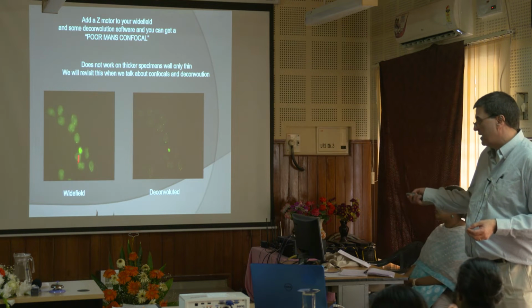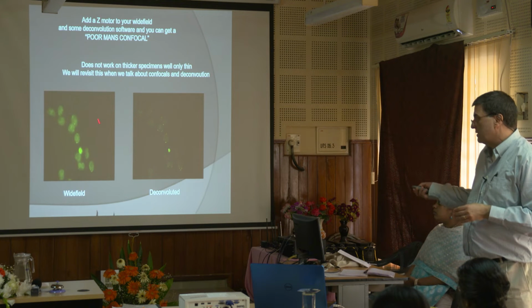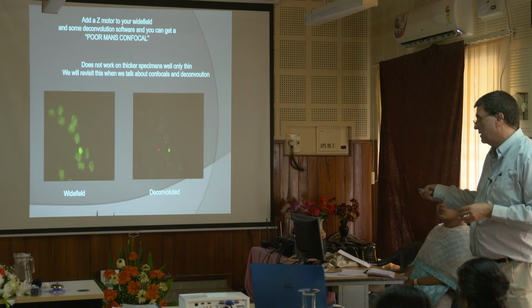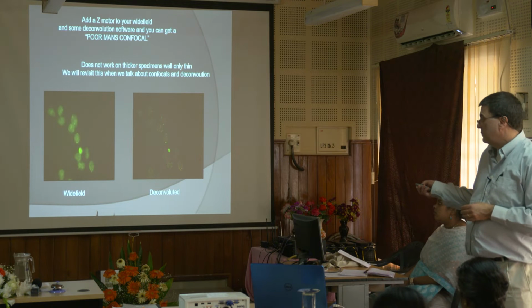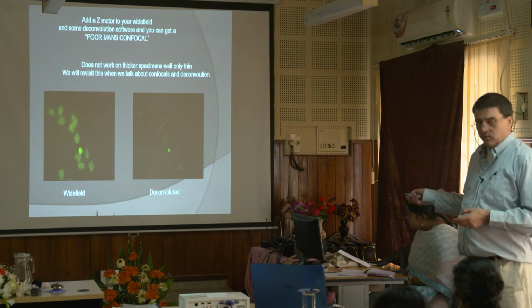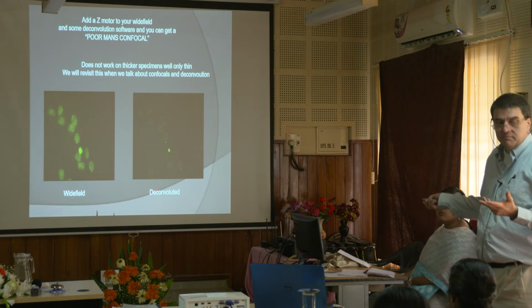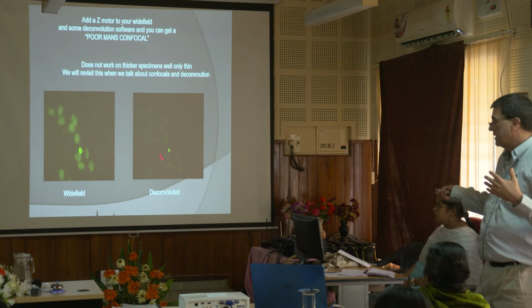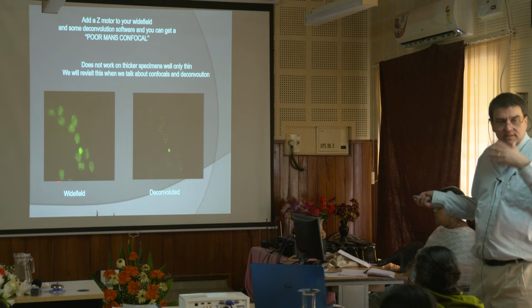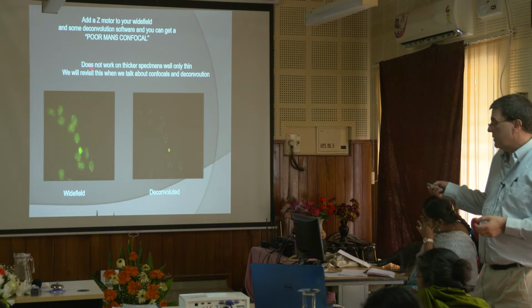We fed all these different parameters in Z, all these different focal planes in, and we ran an algorithm that said, hey, what if this was perfect? We get this out. A lot of times people don't even have to go spend the $40-some on the confocal, because I can come up with stuff that basically mimics it to some extent. Not always, but a lot of times I can get pretty good results like this that save them the trip over there and save them the money. So, like we say, poor man's confocal.